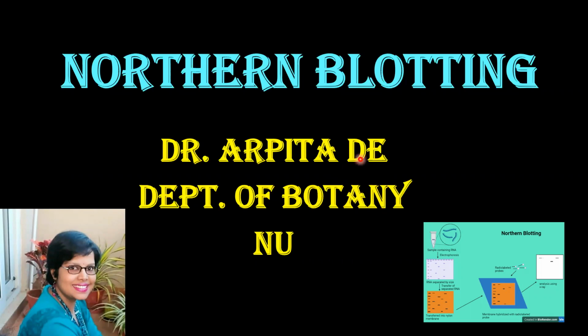Today we will be talking about northern blotting. Blotting techniques, as you all know, are very important tools in molecular biology. And I will try to discuss each of these blotting techniques in separate lectures so that you don't get confused or it doesn't become too lengthy. Okay, so I'll be dealing with each of them one by one. So let's get started. Today's topic is northern blotting.